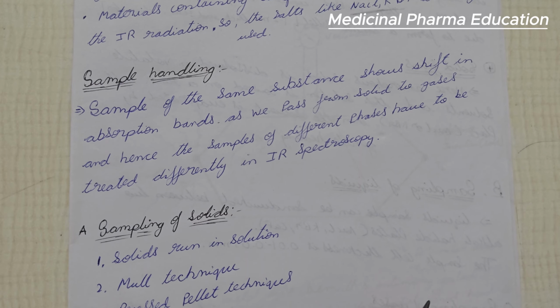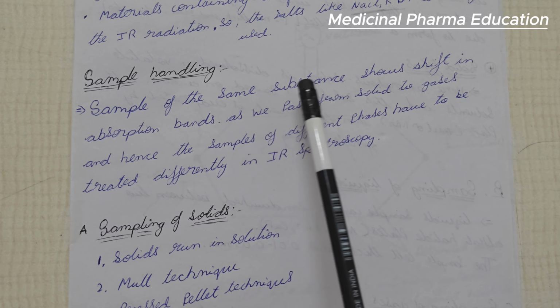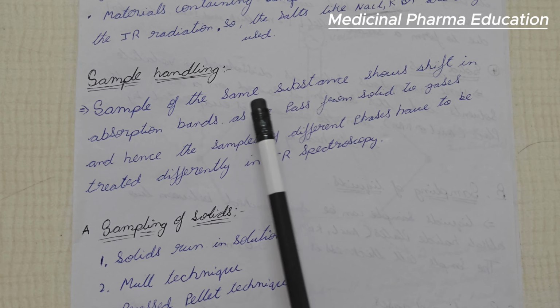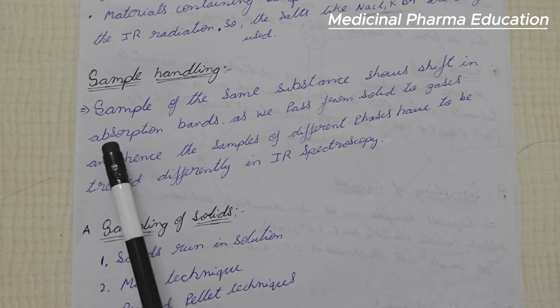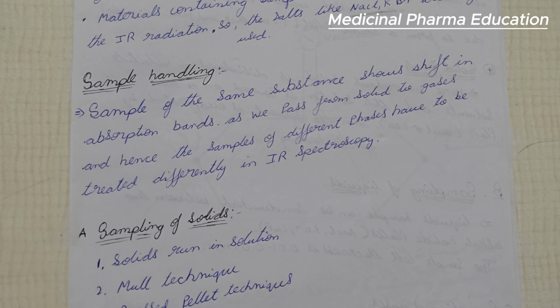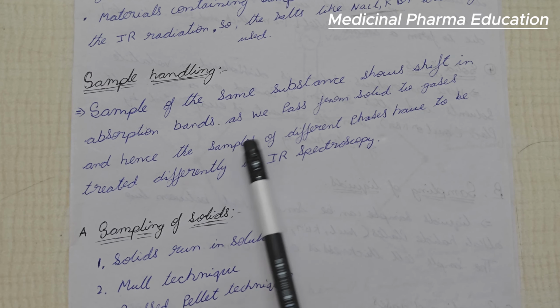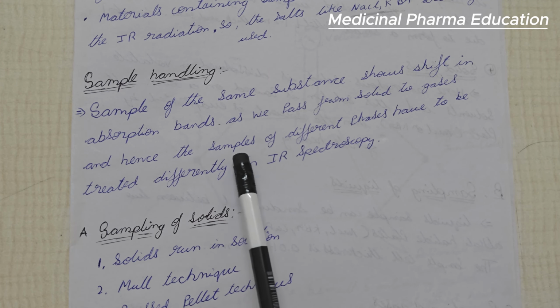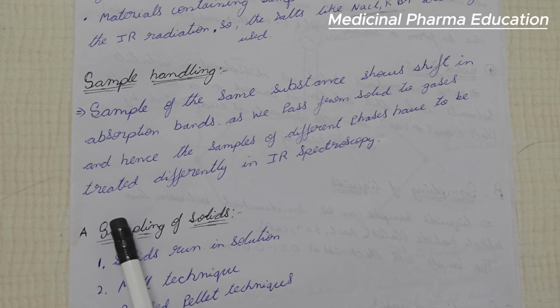Next, sample handling. The same substance shows shifts in absorption bands. If the sample substance is solid, it shows different absorption bands. If it is liquid, it shows different absorption bands. If it is gas, it shows different absorption bands. So sample handling is a must for IR spectroscopy. As we pass from solid to gases, the samples of different phases have to be treated differently in IR spectroscopy. I already explained this sentence.